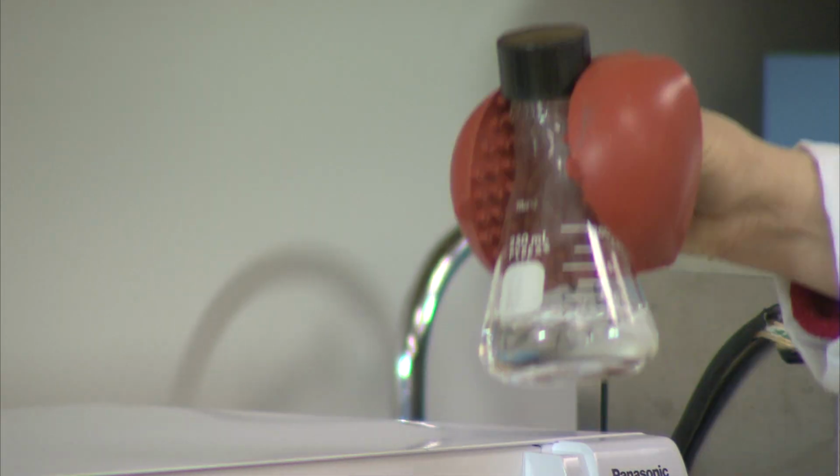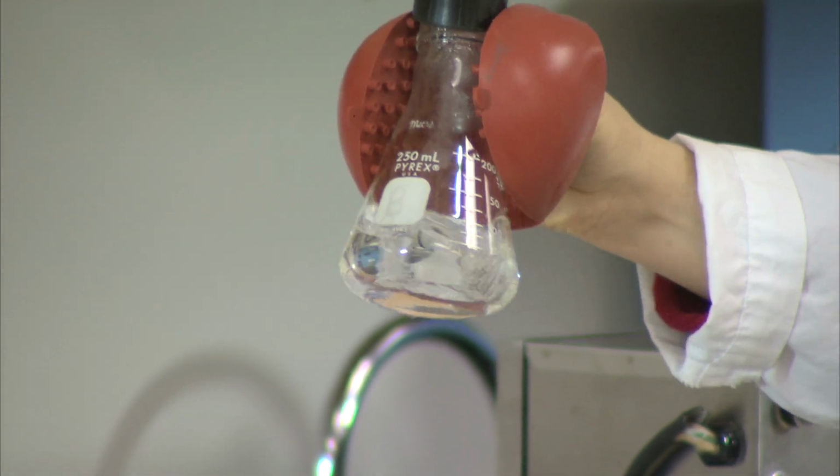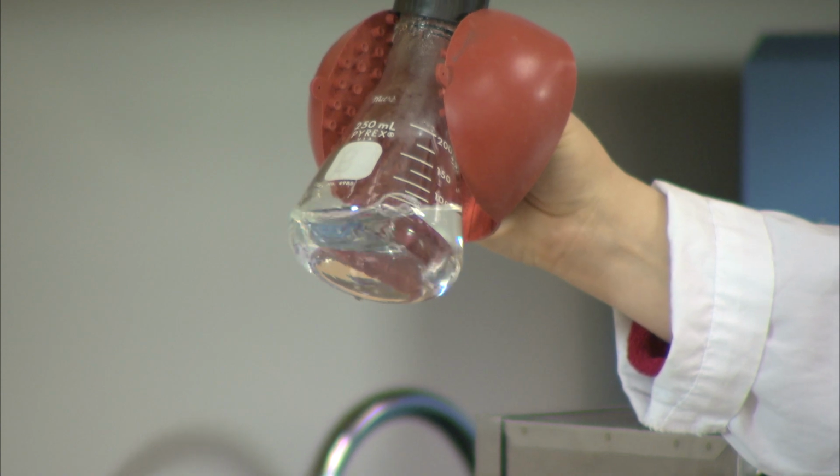When taking the sample out, gently swirl it around and look for small beads of undissolved agarose. If a few are present, they may be melted away with swirling, but if there are many, the flask should be boiled a while longer.